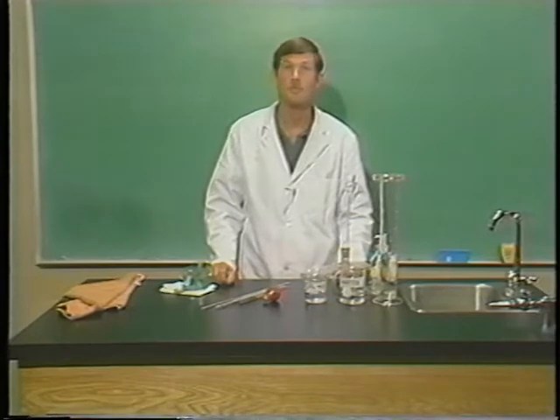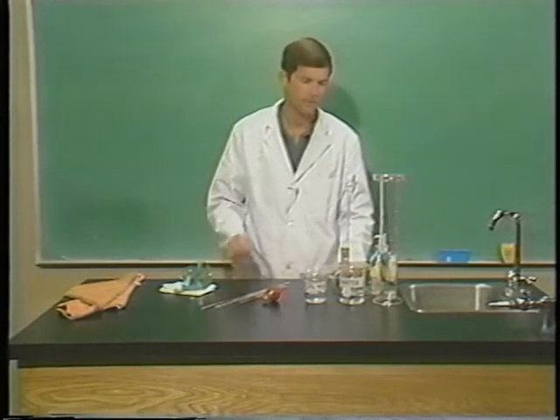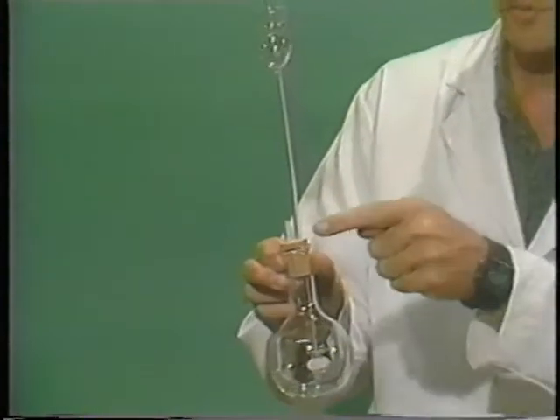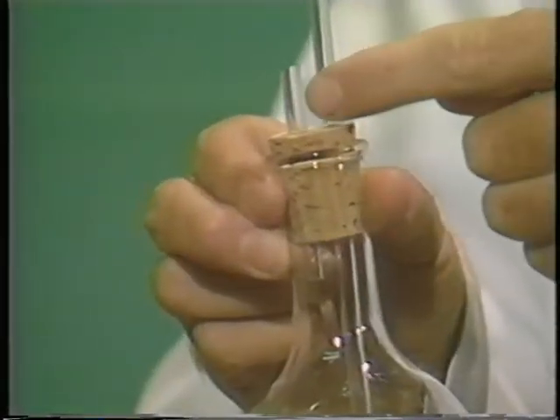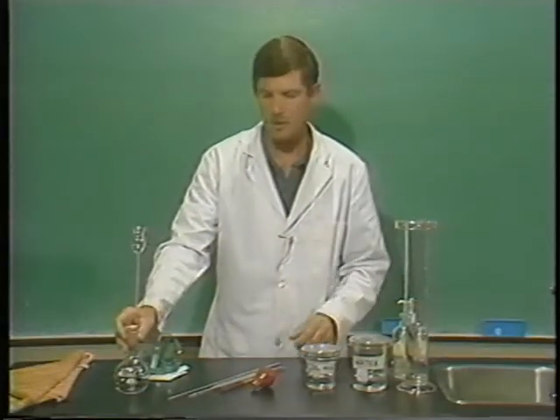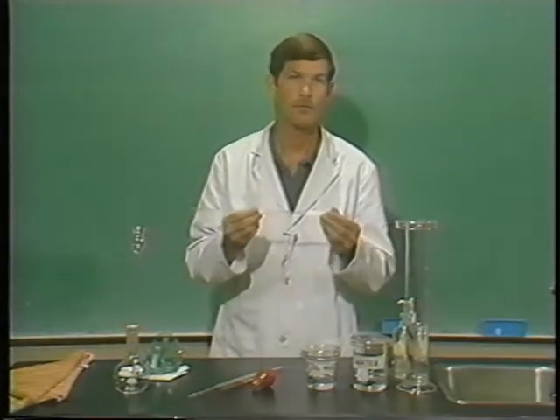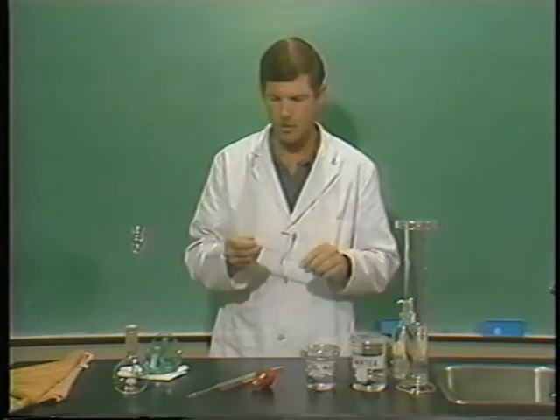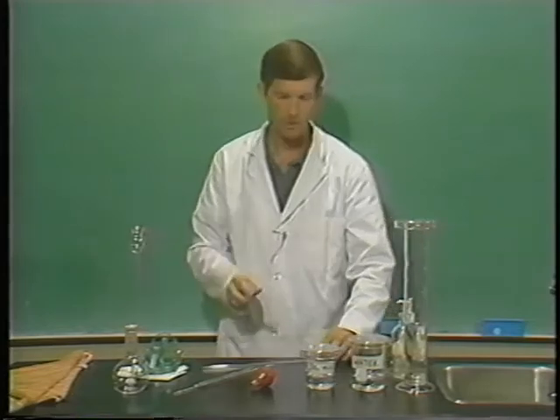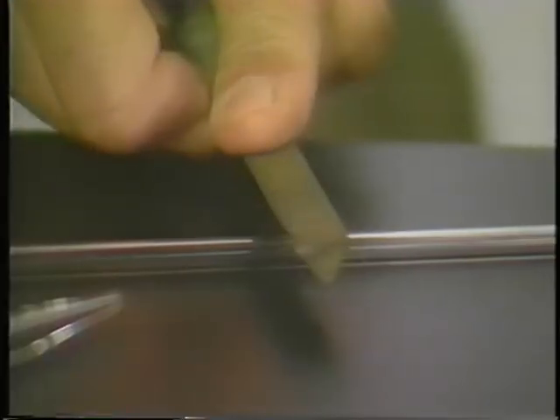Sometimes we have to put together special apparatus for use in the science lab. Let's take a look at this for example. We have a thistle tube funnel going through a cork stopper, and then there's another glass tube to let the air out when the liquid goes in. Now, glass tubing usually comes in long sizes and needs to be cut for particular applications. There's a special way to cut it. You start with a triangular file, and you set your glass tubing down on the table, and you make a scratch mark on it.